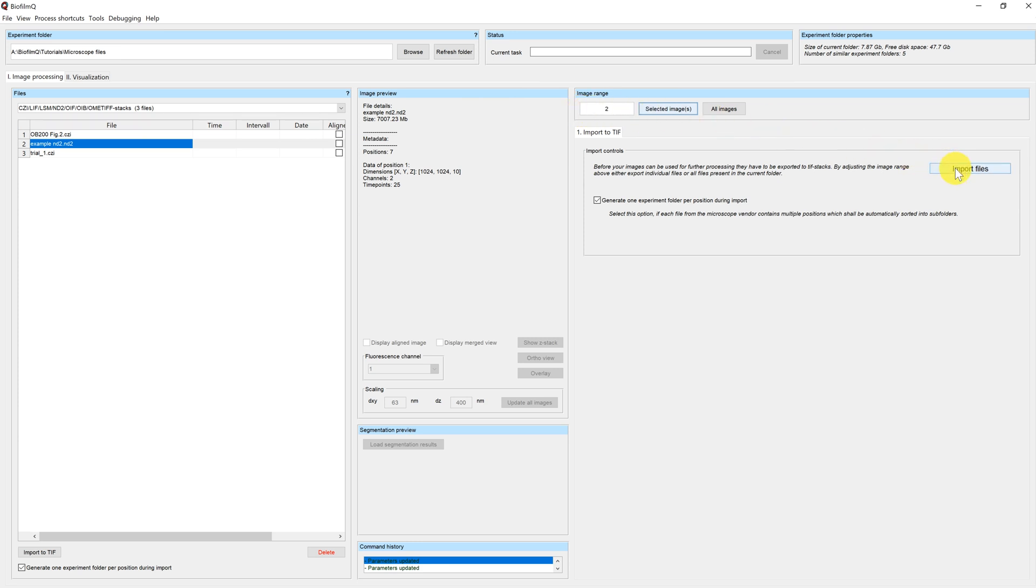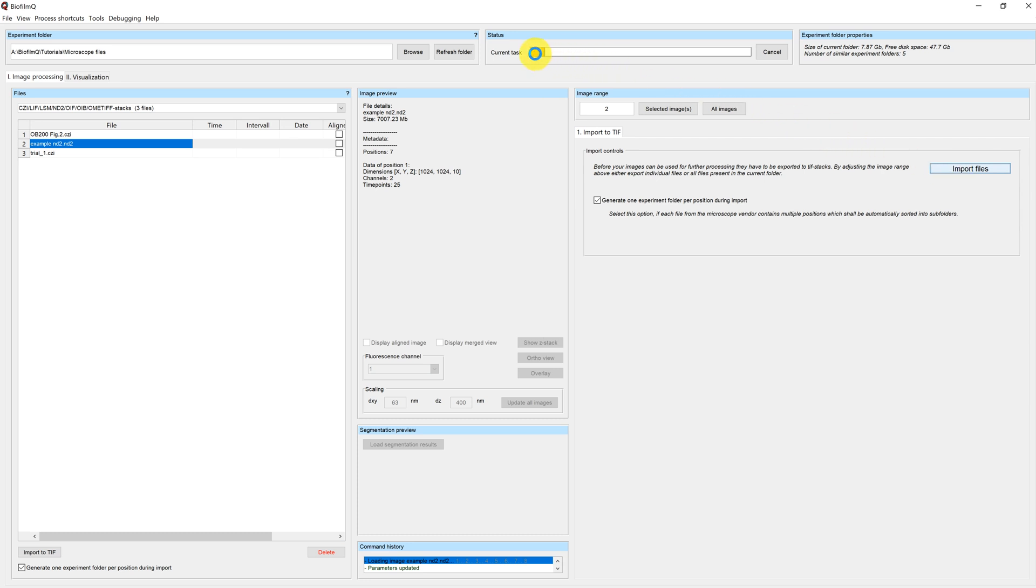So now I'm clicking on import files, and you can see that the import is started. It will take a while because the file is rather large. However, you only have to do this step once, and in the future, we will use the imported data files as they are. You can track how the import progresses in the status bar up here, as well as in the command history, where you can see the number of images that have been generated.